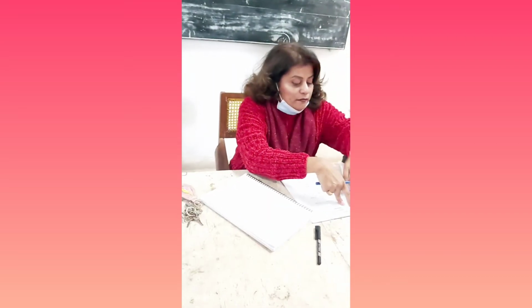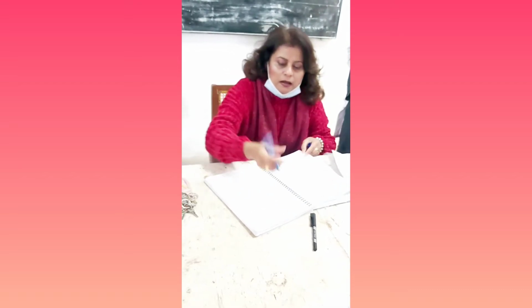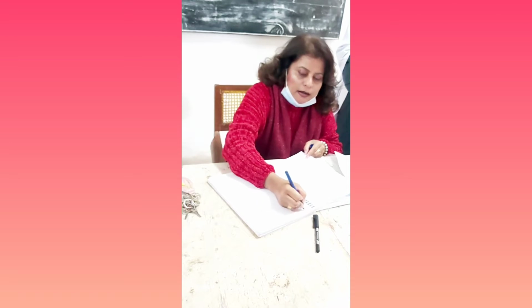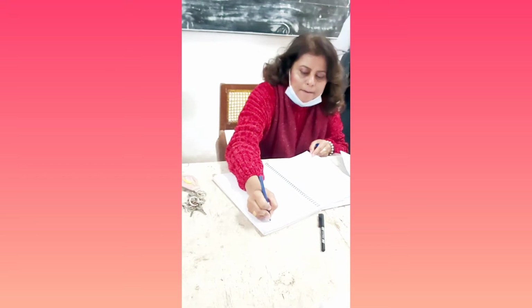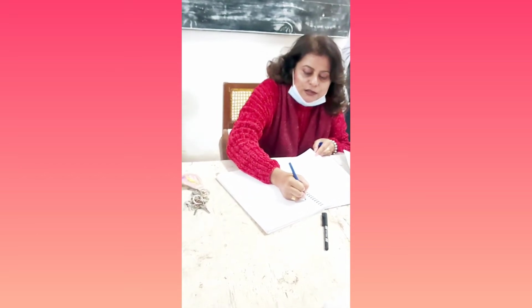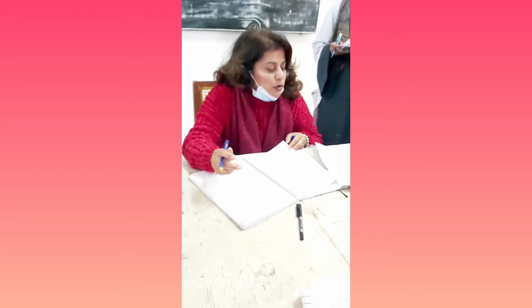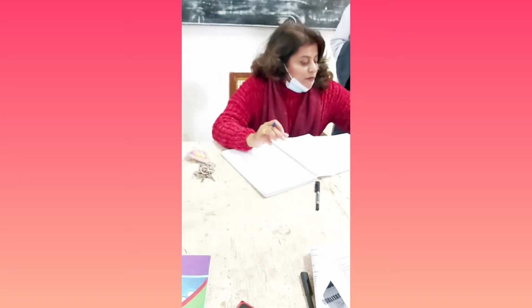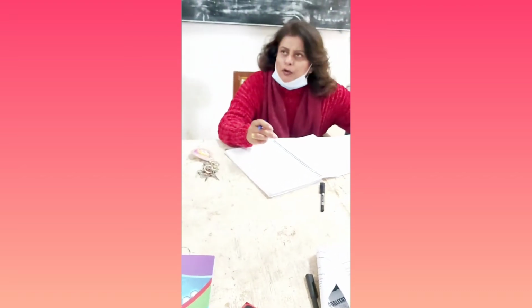And what this test is, ferrous sulfate test, right? You will perform these 3 tests after that. Prepare the sodium extract, and then we will do these 3 tests. On the next page, you are going to make 3 columns, just as you have done before: experiment, observation, and inference. And you are going to write down the first test, that is test for nitrogen. What is that? That is the ferrous sulfate test. Now you are going to use 1 ml of your sodium extract and react it with ferrous sulfate, followed by a few drops of sulfuric acid. And you are going to get a Prussian blue coloration.